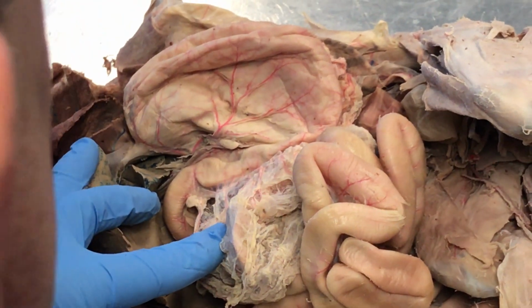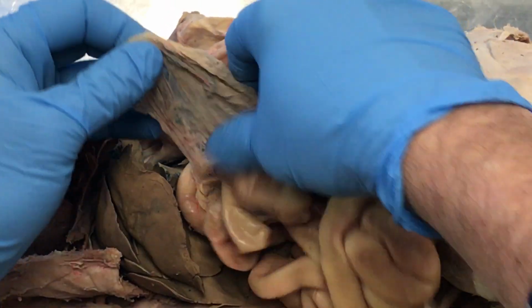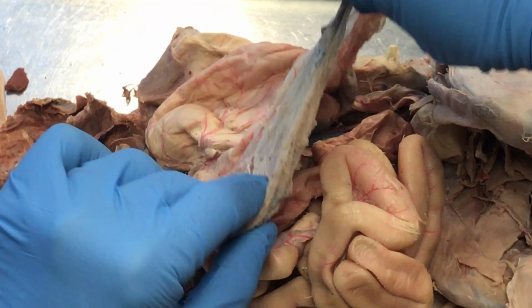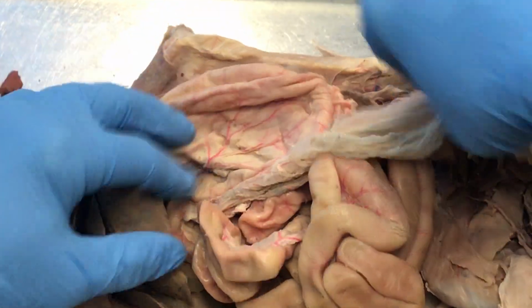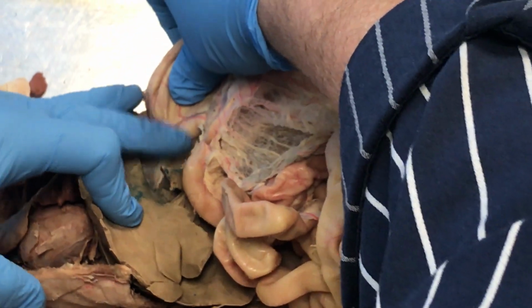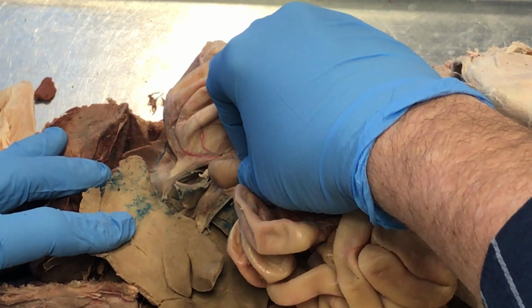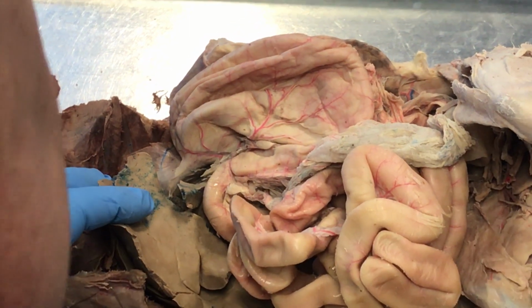So we covered that. Greater and lesser curvature, we covered that. We covered greater omentum. The greater omentum comes off the lower part of the stomach. You can see it right there. There's stomach, there's greater omentum. The lesser omentum goes between the liver and the stomach. There's still a little bit of lesser omentum still attached, and you can see a little bit of lesser omentum here as well. Okay.